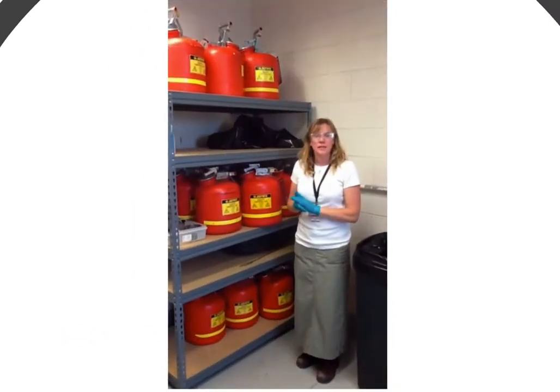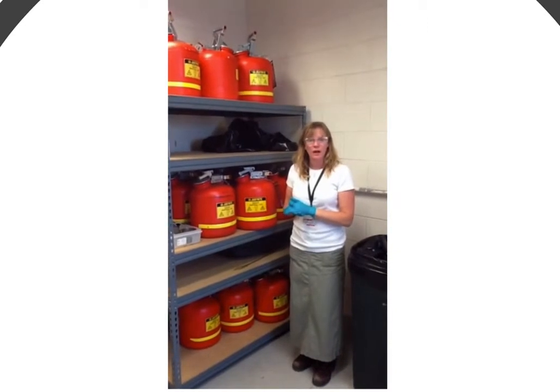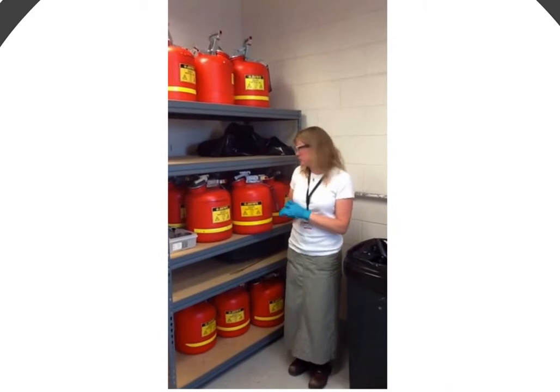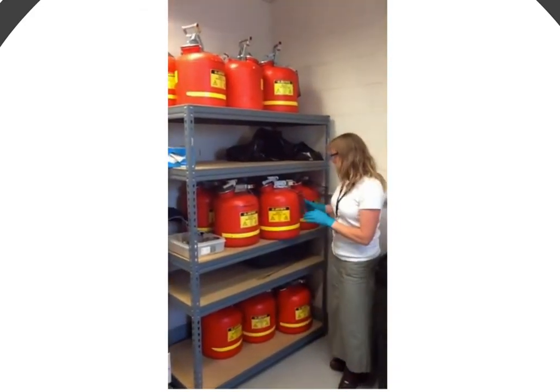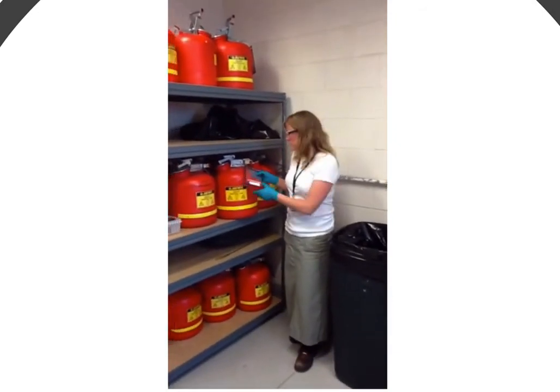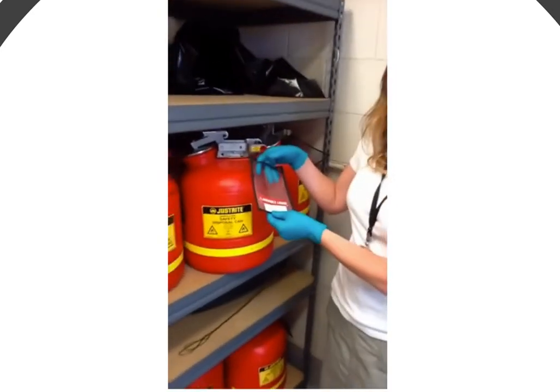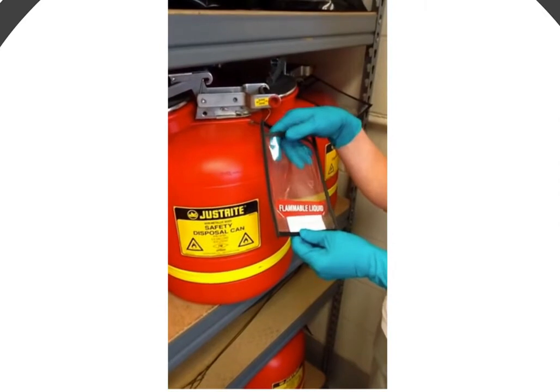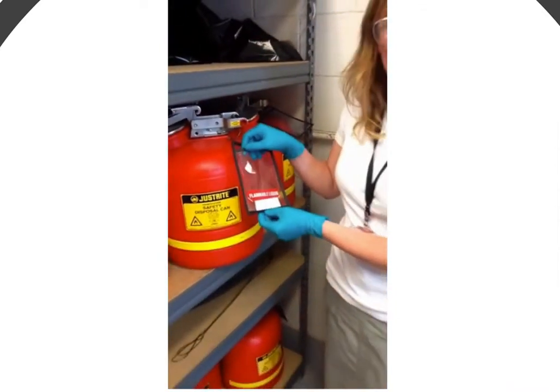I'm standing in the central waste facility in the bulking room. For our larger solvent generators, we can provide them with a safety can that holds 5 gallons. We have certain solvents that can go into these, and so we ask them, the ones that we didn't provide these for, to put the hazardous waste green labels in here to tell us exactly what is in there, and then we can separate that into the specific drums that it will fall into.